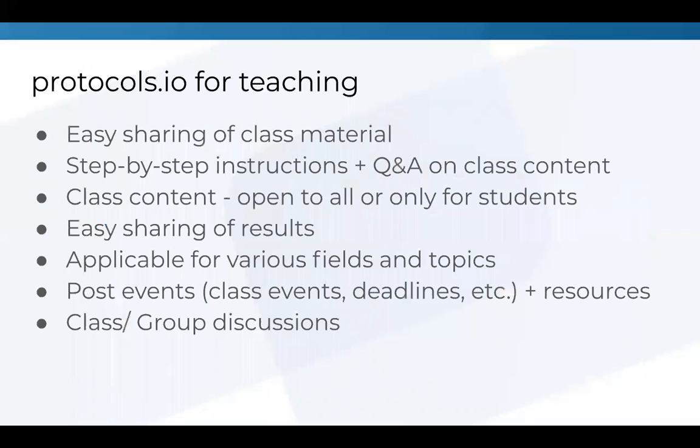So why is it good to use protocols.io for teaching? It makes it very easy to share class material. If you're teaching, you can share the step-by-step instructions with the students, and there can be a Q&A on the class content directly, as I showed before with the commenting functionality. The class content can either be open to all, or you can choose to make it private and only accessible for your students. And it's also very easy for the students to share their results.